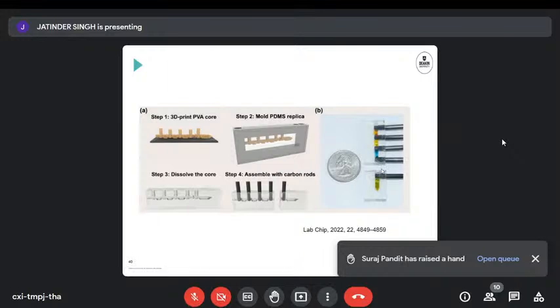But that's kind of the exception. So here you can see some colored dyes to illustrate the fluidic insulation. You can see none of the yellow here is moving into the blue zone. So these carbon rods are actually really effective at keeping these little containers separate.